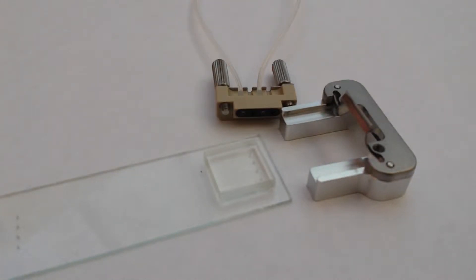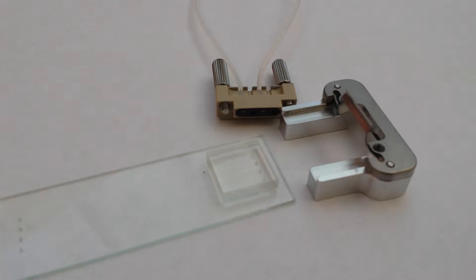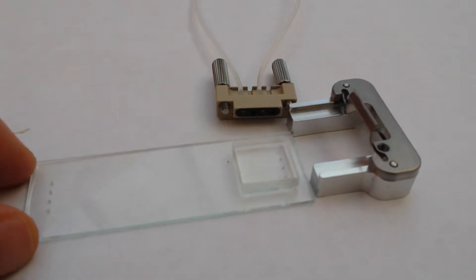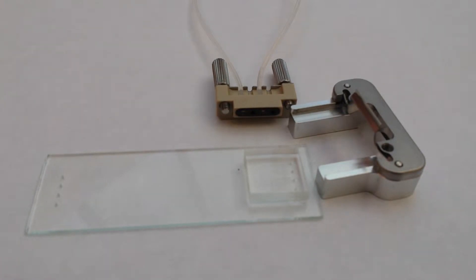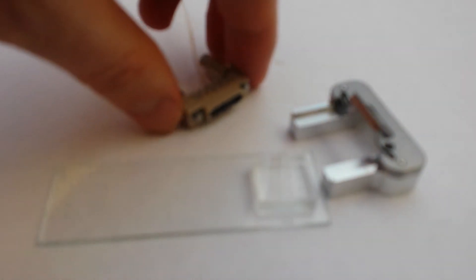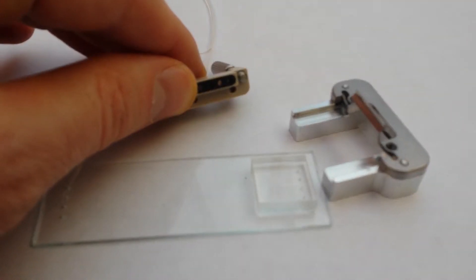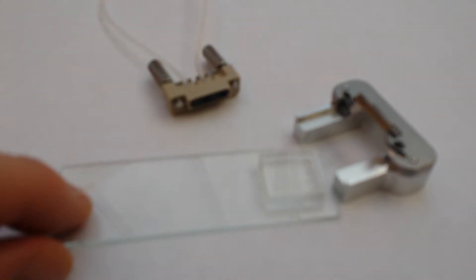This is a quick video regarding the PDMS interface system from Dolomite. This is an interface system for people making microfluidic devices out of PDMS. What we have here is a PDMS-constructed device mounted on a glass slide. Dolomite provides these glass slides and there are some very good design rules — they control the distance of the holes from the edges and define the pitch so that they are compatible with their connectors, which make very good connections onto the holes.